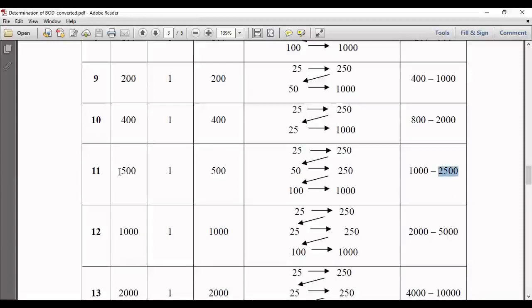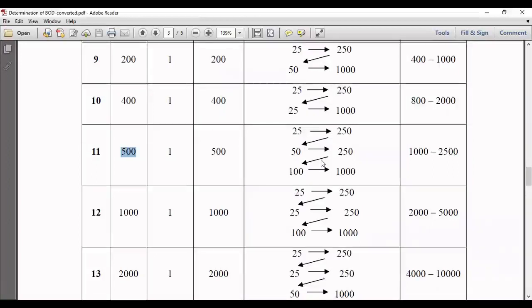So here we have achieved the dilution with the help of triple dilution, right? So single dilution, double dilution, triple dilution is the way in which we can achieve this. You have to be very careful while performing this dilution, and it will particularly help you to gain accuracy.